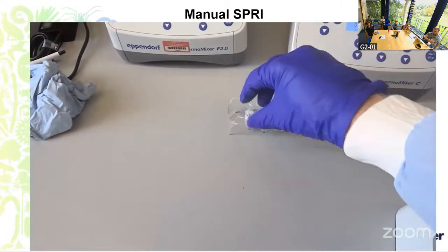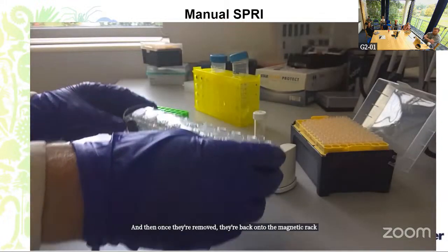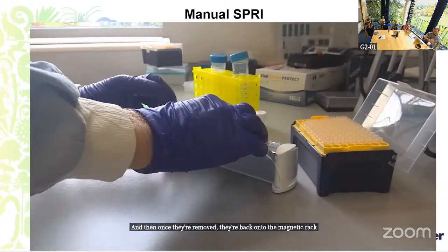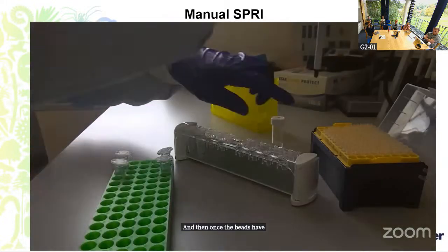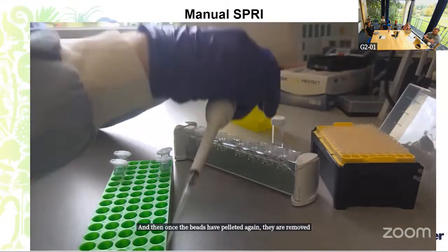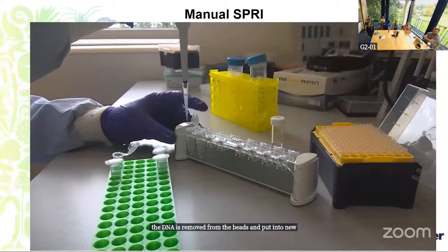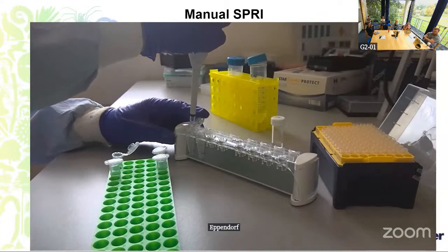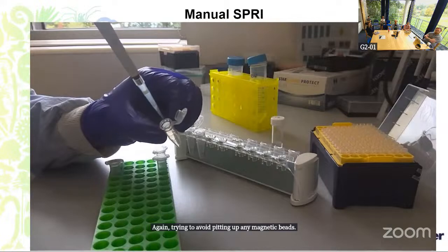Once they're removed, they go back onto the magnetic rack. Once the beads are pelleted, the DNA is removed from the beads and put into new Eppendorf DNA LoBind tubes, again trying to avoid pipetting up any magnetic beads when you can.